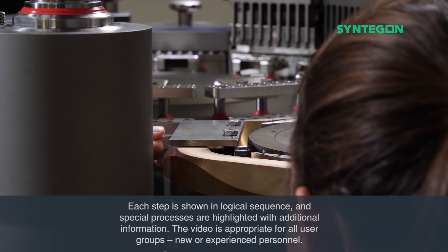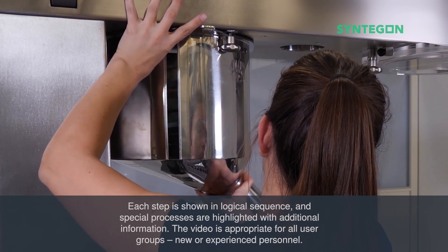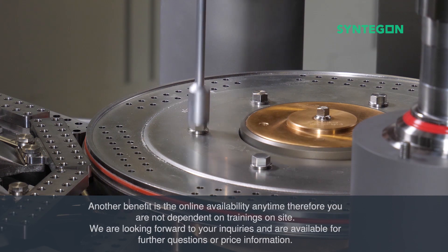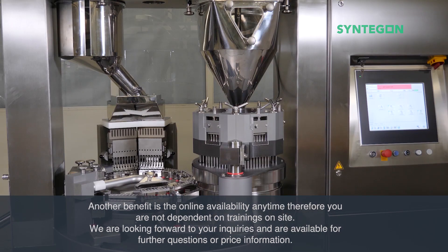Each step is shown in logical sequence, and special processes are highlighted with additional information. The video is appropriate for all user groups — new or experienced personnel. Another benefit is the online availability anytime, so you are not dependent on on-site trainings.